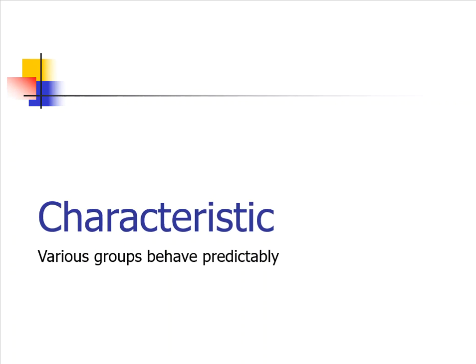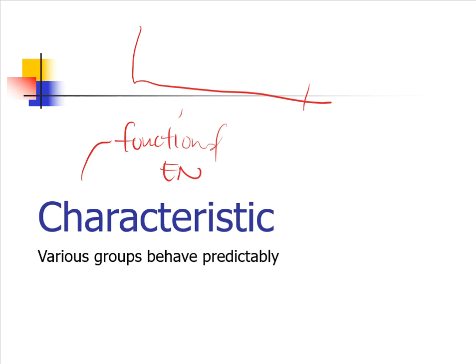So in this video, we're going to look at characteristic banding properties of NMR, or shift properties of NMR. Basically, we have talked all of this time about functional groups, and these functional groups have electronegativity values. Those electronegativity values affect the way that NMR signals show up on the spectrum. So here we have the 0 mark, which is due to the TMS.